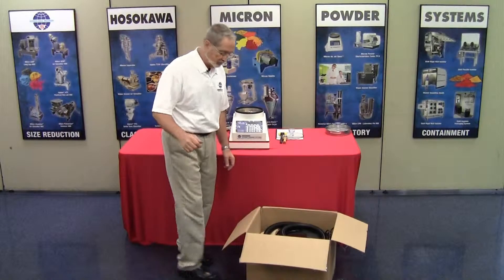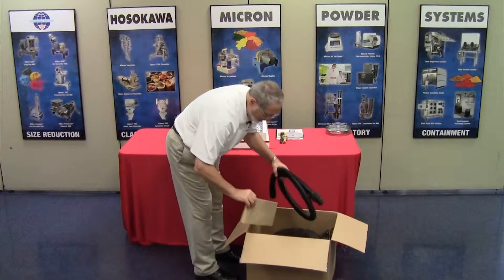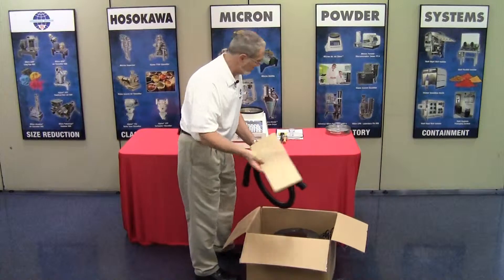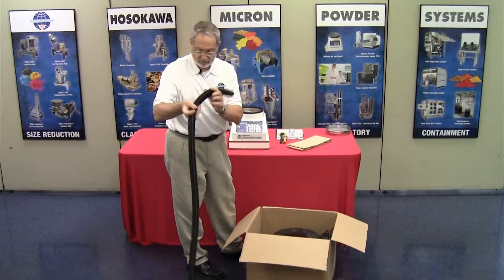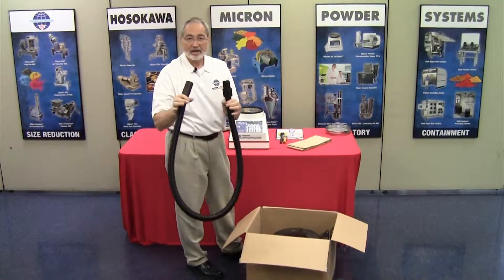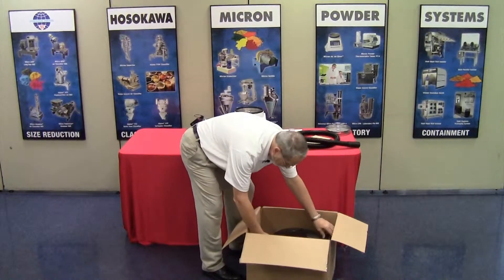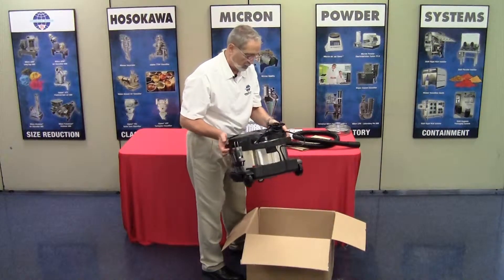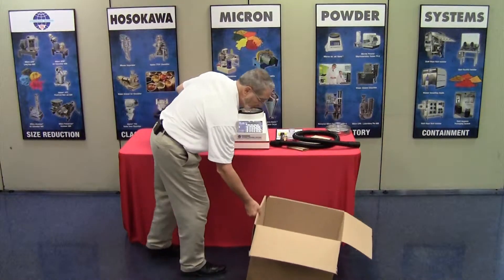Now, to the vacuum. We're going to open the box, which has already been pre-cut, and check for the contents. In a brown box, you will have two spare paper filters. You also have a length of hose — approximately two meters in length — and this is an anti-static hose. We'll set that aside, then remove the vacuum.